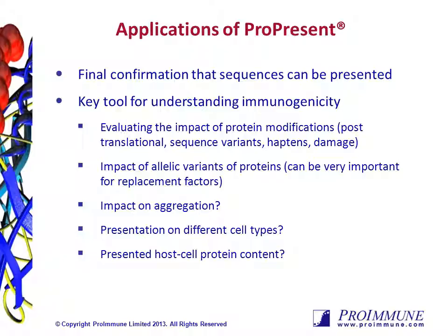Although our standard method works with monocyte-derived dendritic cells, the method is flexible and we can really look at presentation from any cell type that expresses the MHC molecules of interest. In the context of immunogenicity, it is also possible to look at host cell protein presentation.